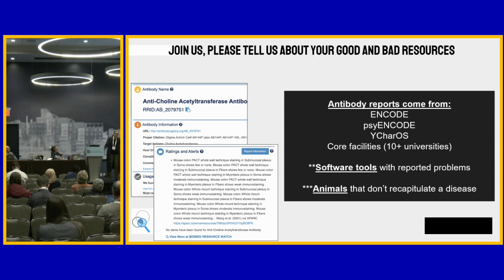If we already know how to record these kinds of information about cell lines, and if you give it to us, we will push it to the right authority. But if you know that from antibodies, we're the authority. Please tell us. There's a way to report that data on every single RRID page that there was a problem with this resource. This is what happened.